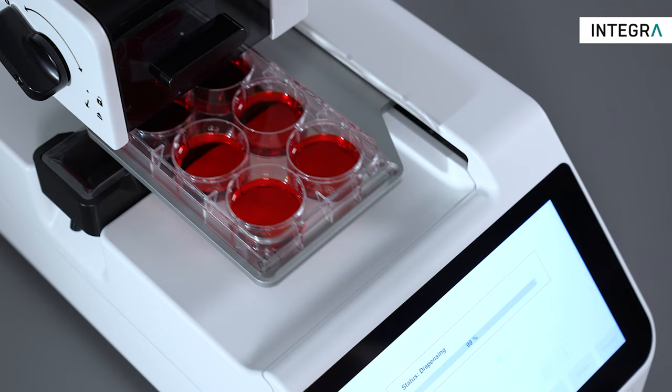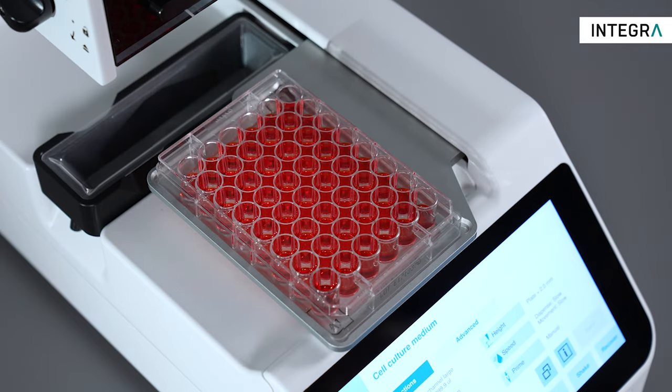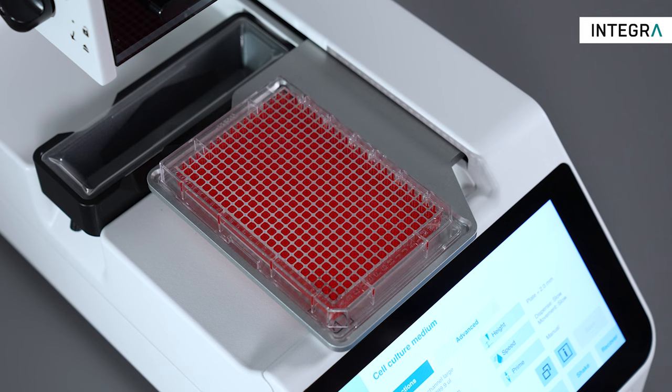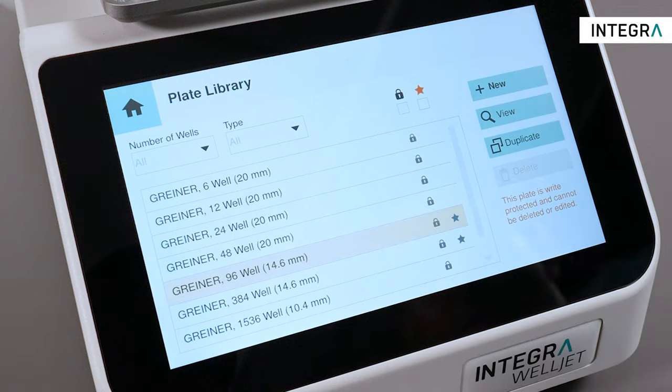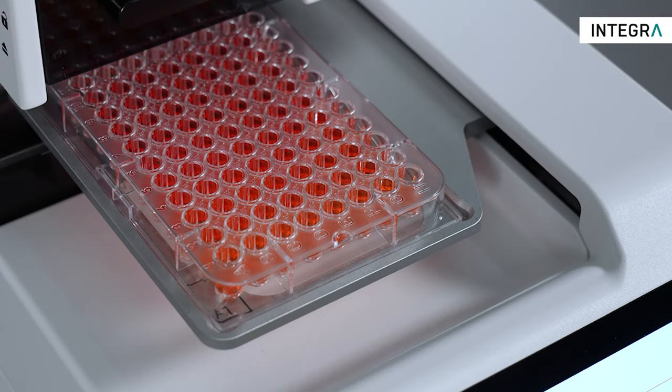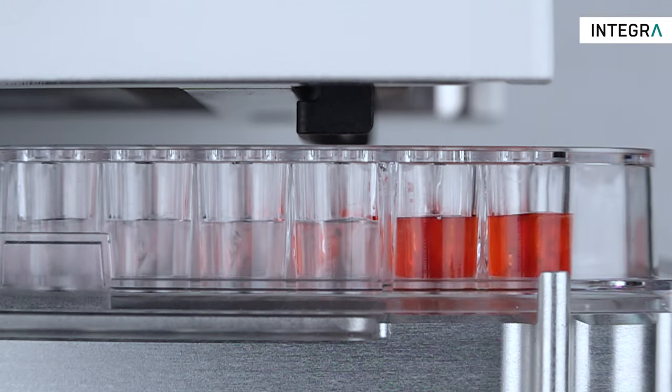Any plate format from 6 to 1536 well plates can be handled on both units, depending on your application and sample throughput. Just choose your plate type and a vast number of applications can be supported, from reagent addition to ELISAs and cell-based assays to compound screening assays, or simply use it to add buffer or medium to your plates.